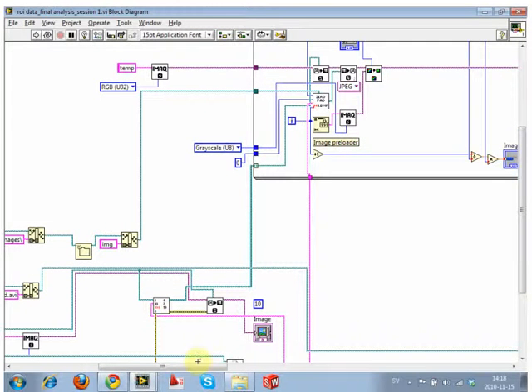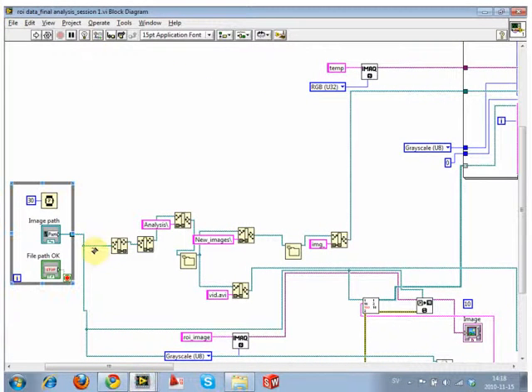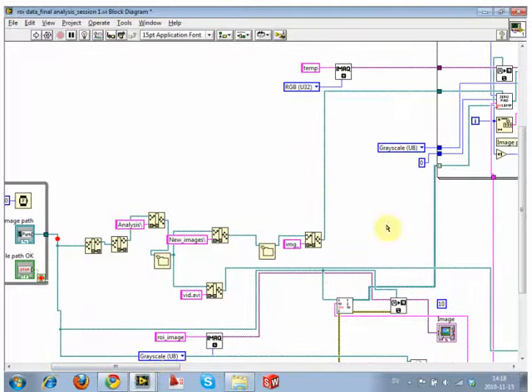It can be an organizational thing. It can be in one of these places. But to deal with moderately high-level programming, if you right click on a wire, we can create what's called a breakpoint. You hit set breakpoint, you get this little red dot. It means stop here, so that's where we want it to stop, step by step, and find where it comes from. So what we're going to do is watch the data run down here and see what's happening.